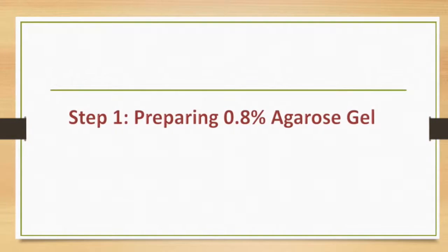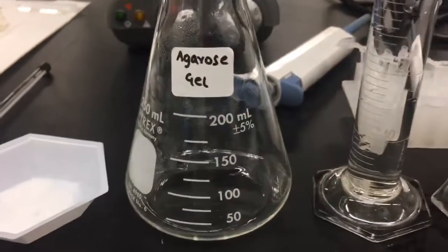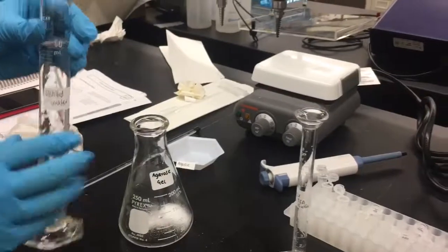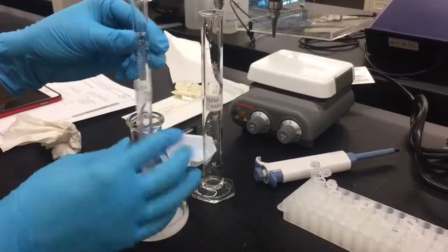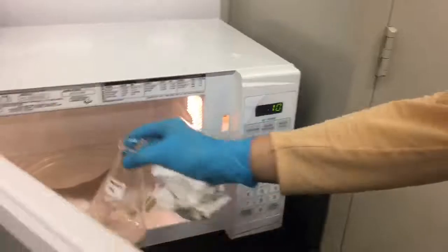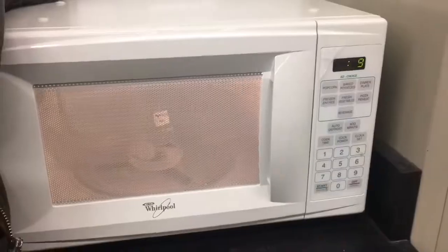Step 1 is to prepare 0.8% agarose gel. First you have the agarose, then the Erlenmeyer flask, then the distilled water and TAE buffer. You mix the agarose with the distilled water and the TAE buffer in the Erlenmeyer flask. Then you put the Erlenmeyer flask in the microwave oven to heat it for 30 seconds or so to make sure all the agarose is dissolved in the solvent.